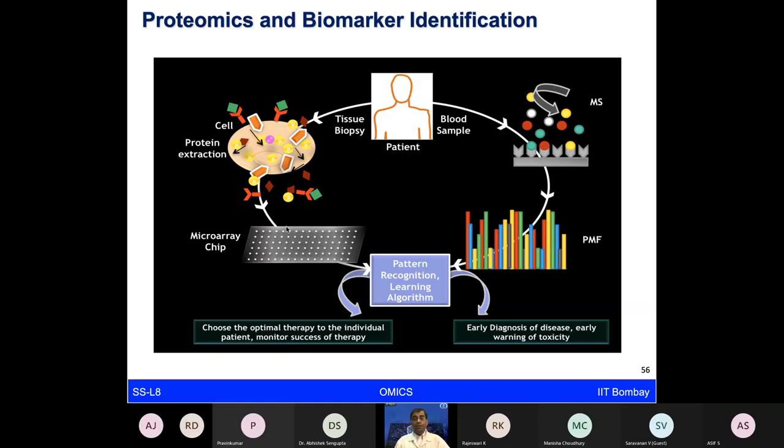In case of COVID also, it's quite relevant that we are looking at the IgG, IgM, these kind of immunoglobulin responses. And if we can have these viral peptides on the arrays, we can map the epitopes, that is, which epitopes are showing the maximum humoral response with the serum if you take from a patient sample. And some of these experiments are actually going to open up more and more new knowledge, which is really required right now to understand how this virus is working and what more options we can have available. If this vaccine does not work, do we have more epitopes, multi-epitopic regions which we can target, and we can come up with a new vaccine in subsequent timeline.